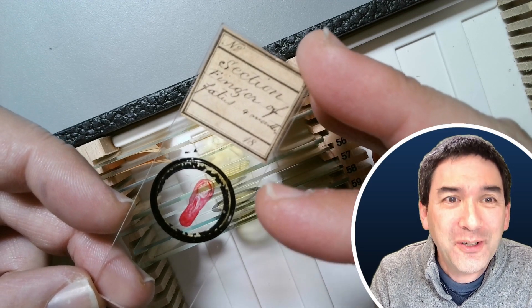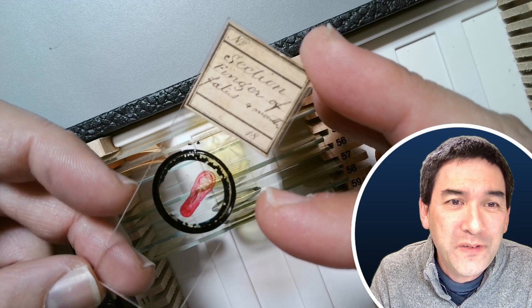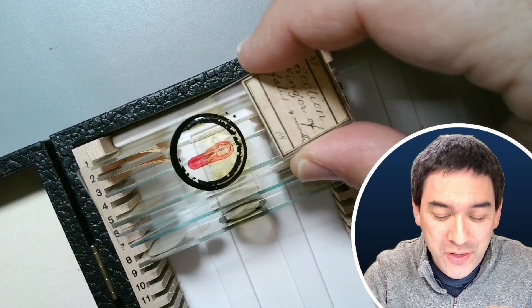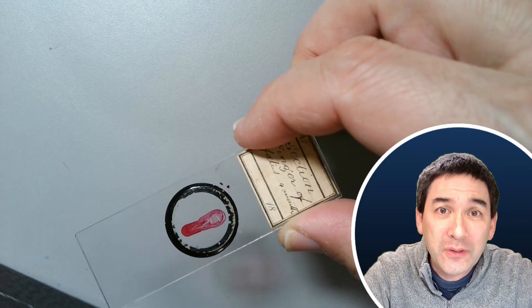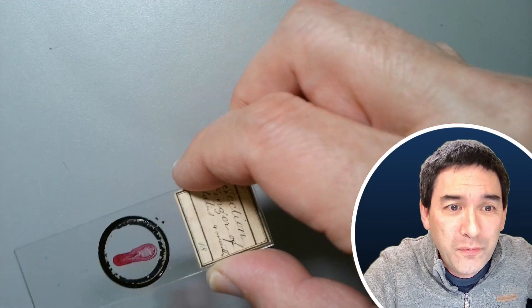Not the fetus itself, but the finger of a four-month-old fetus. Let me put this box away first and put it under the microscope to have a look at the different parts of this specimen.